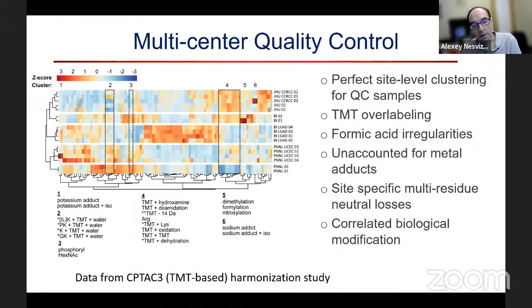You can run it again for QC. This is where we run this pipeline as part of our CPTAC efforts. We are a member of the CPTAC consortium, where we work with a ridiculous amount of TMT data. But here we run it as a QC run using CPTAC 3 harmonization data generated at 3 different sites, Johns Hopkins, Broad Institute, and PNNL, where they use the same samples analyzed through a harmonized pipeline, but at different sites.